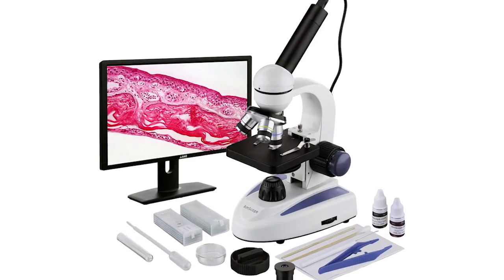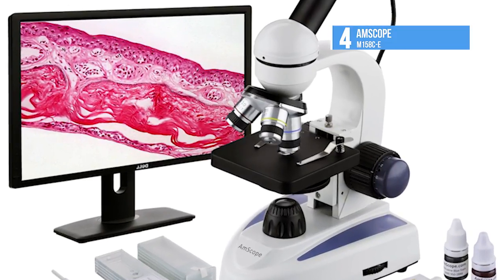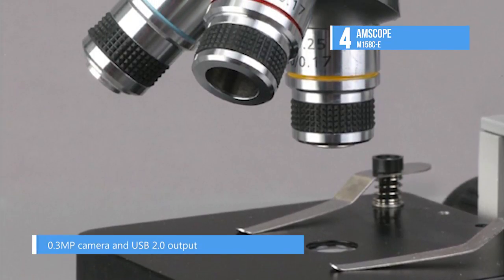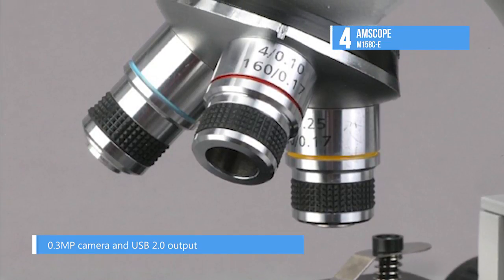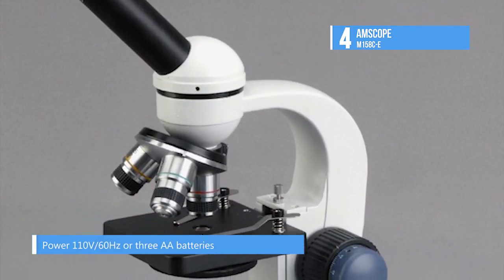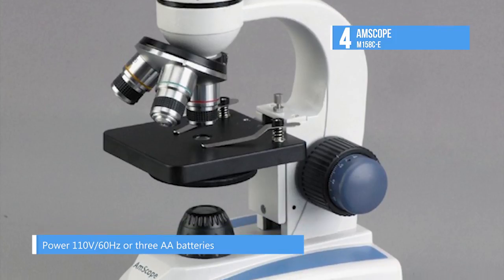At number 4 we have the Amscope M158C-E. It boasts three achromatic objectives and two magnifying eyepieces, as well as a 0.3 megapixel camera for capturing your images. The monocular viewing head features a fixed 45-degree inclination to help reduce eye and neck strain.